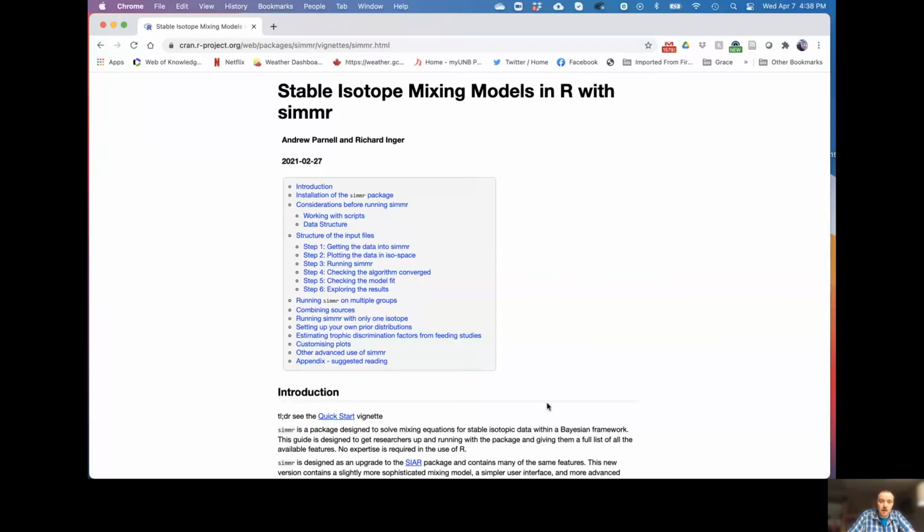So I'm going to work through a quick worked example here. A lot of what I'm using is applying what they have in their worked examples, but with the data that we talked about yesterday. Use this when you're applying it to your own data, for your own studies and your own models.